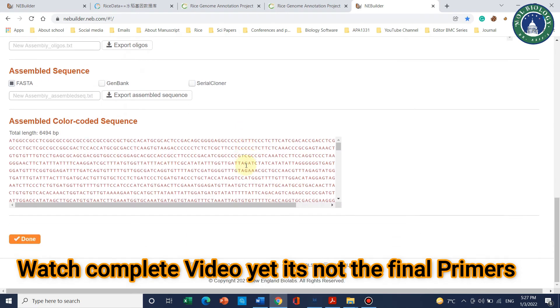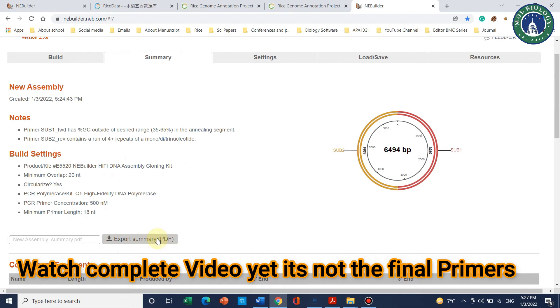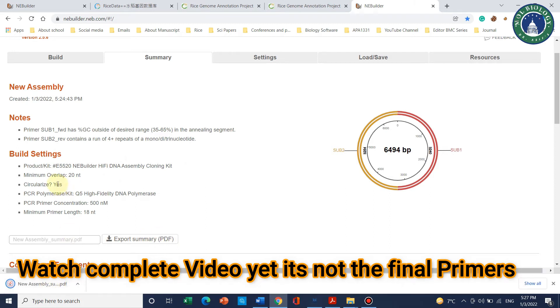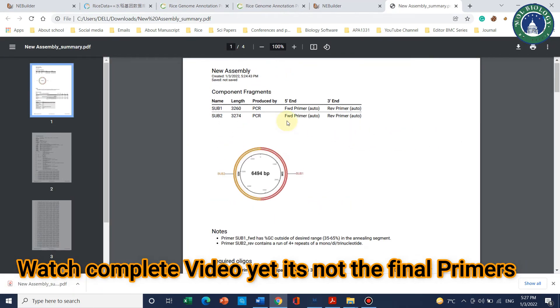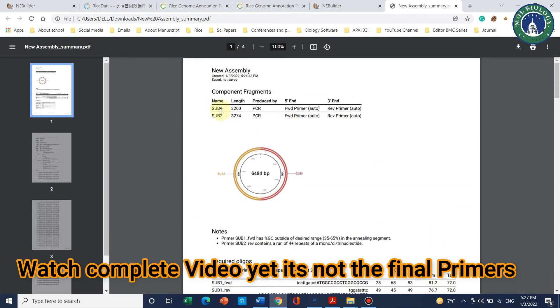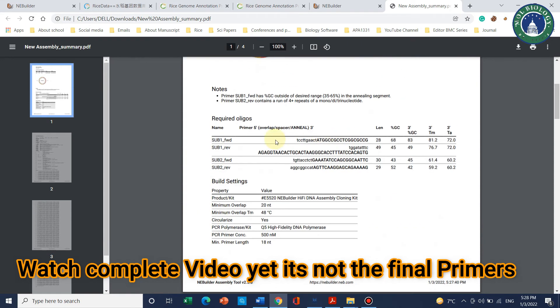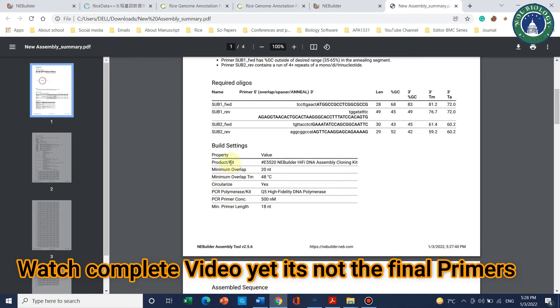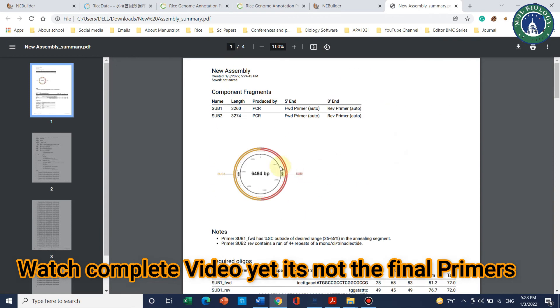We can export the summary as a PDF. In the overall build settings, we can see the assembly of this gene. Sub Part 1 has a length of 3260 and Sub Part 2 has a length of 3274. These four primers have been generated — you can send these sequences to a company and they will synthesize the primers. The build settings show that you can use the NEB HiFi DNA Assembly Cloning Kit, and it currently shows the fragment as circular.